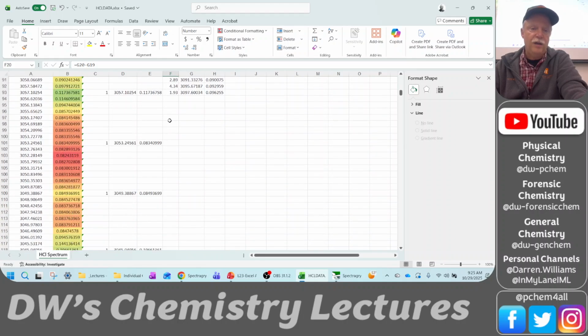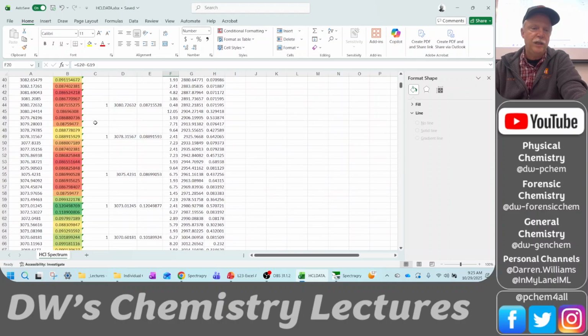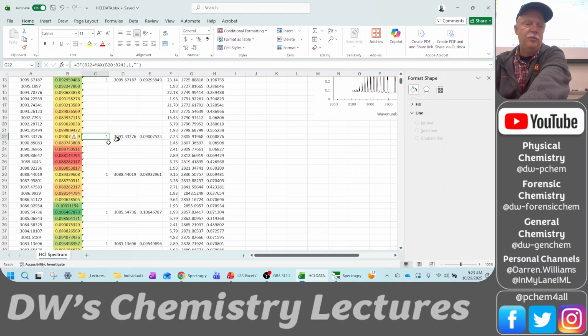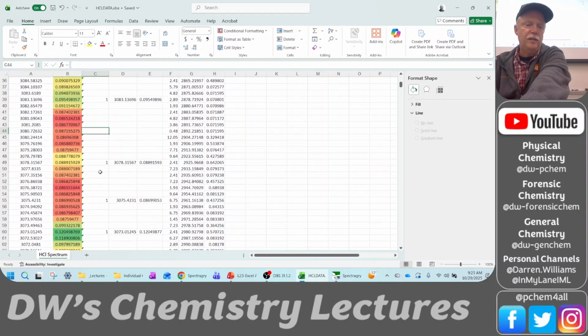Yeah, so we've got a lot of lines that are still in this red region. So maybe we should go back and clean that up. Like this one, we're getting too many of these right here. So we want to delete this, we want to delete that. Let's spend some more time cleaning this up.